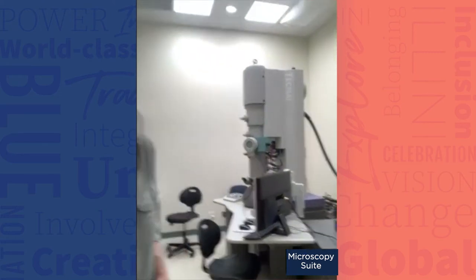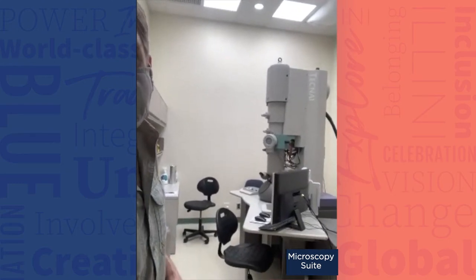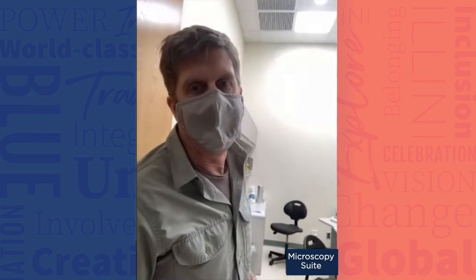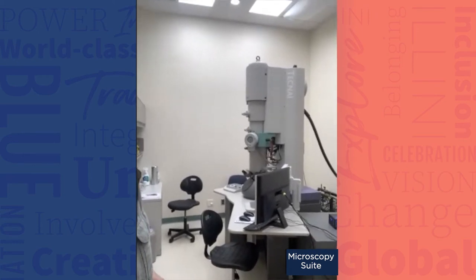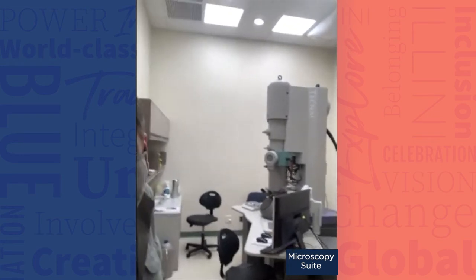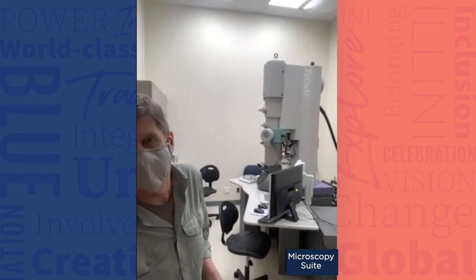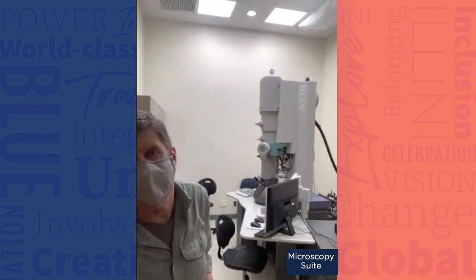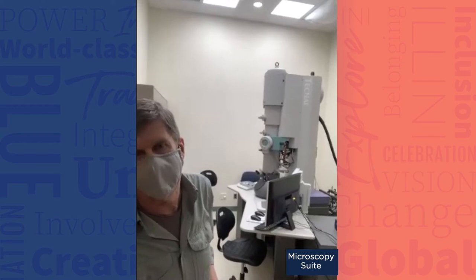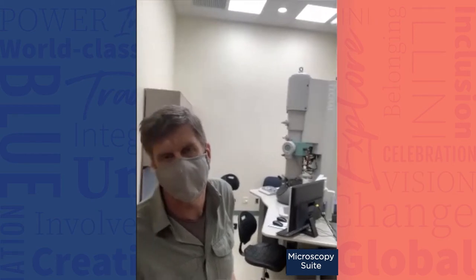We have a brand new transmission electron microscope — specifically a scanning transmission electron microscope, an STEM. It's a refurbished system with 4K by 4K cameras. It does high-angle annular dark-field imaging, which is a really cool technique where you can get a sort of elemental analysis out of it. Because it's an STEM you can control the beam, and if you can control the beam you can also do EDS, so down the road we'll be able to do elemental analysis using the STEM system.